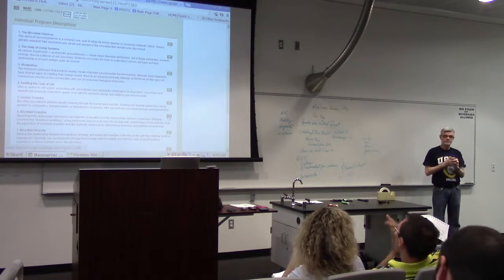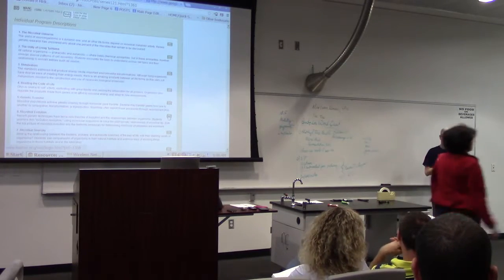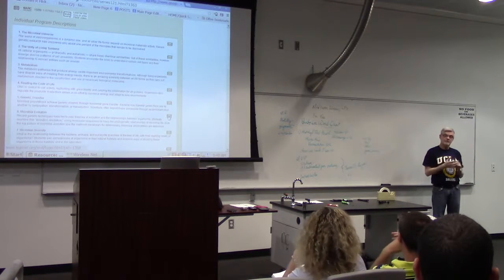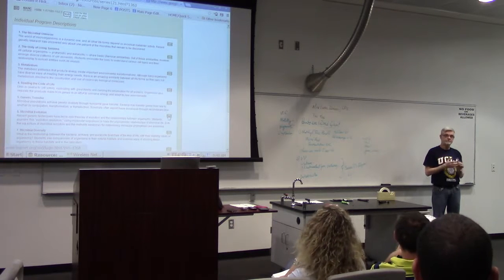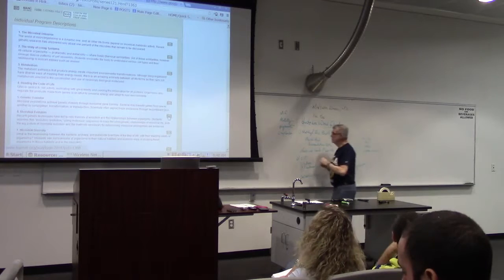What I'm trying to say is for VP, for example, yesterday we did it, today we have to read it and determine whether it's positive or negative and discard the two, right? But if you waited till Monday, it would still be red if it was positive. It wouldn't revert. Go backwards. All right, so that takes care of MRVP.